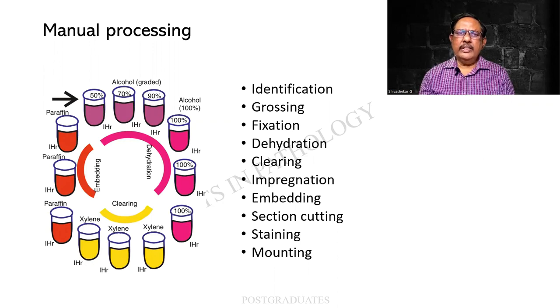There is something called manual processing. This particular slide I have put up just to recapitulate the various stages through which tissue processing goes, and also what the various stations are. This is conventional and almost constant. So this list I will not be reading again. You are supposed to be very familiar. Each of these is an ocean by itself.